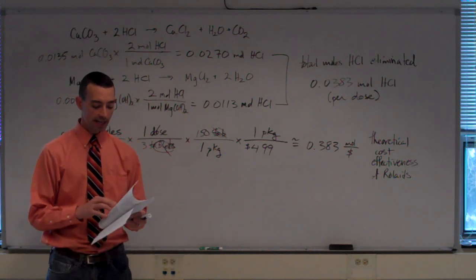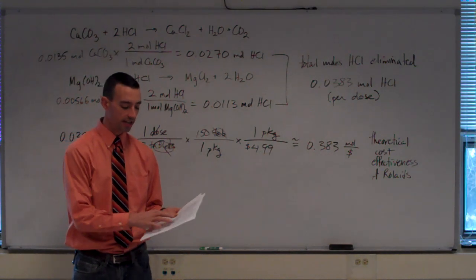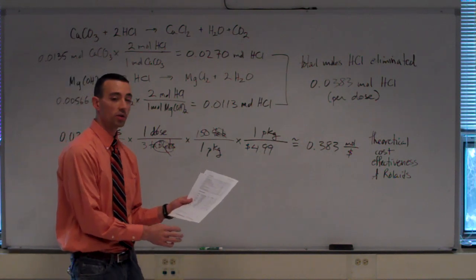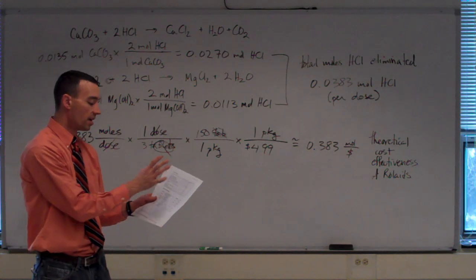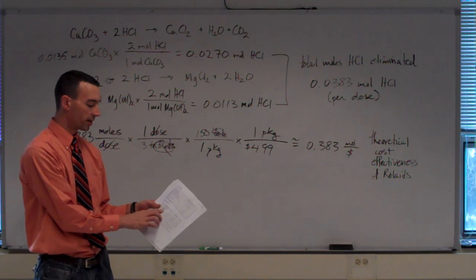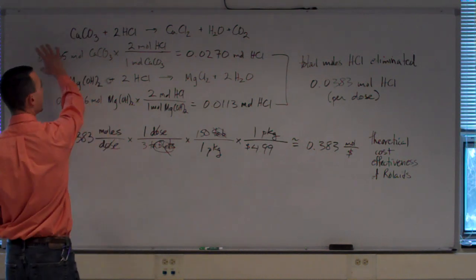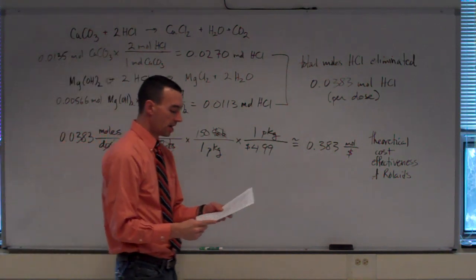Each of those antacids has its active ingredient information contained in a table in your laboratory manual. So you'll need to mimic the pre-lab series of questions that we just did for each of those. Tums is very similar. It has only 500 milligrams of calcium carbonate, so you can use the calcium carbonate reaction that we just did to work your Tums.